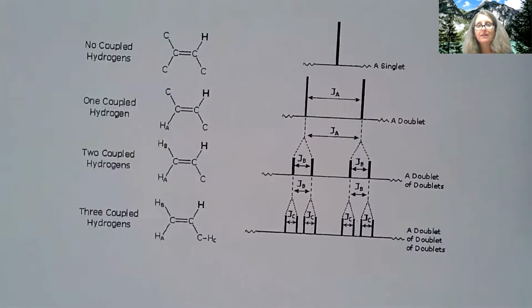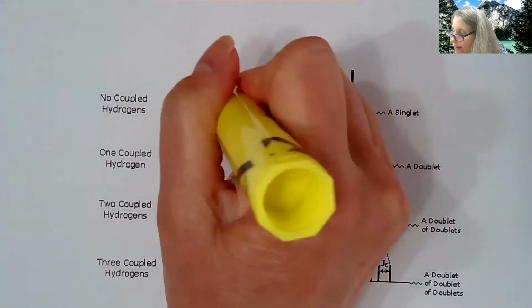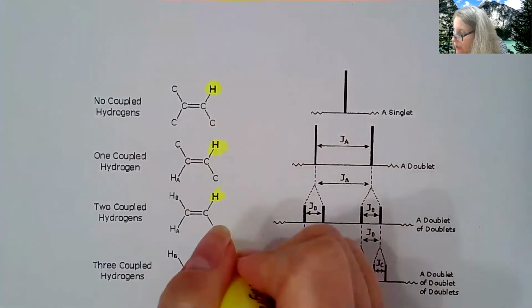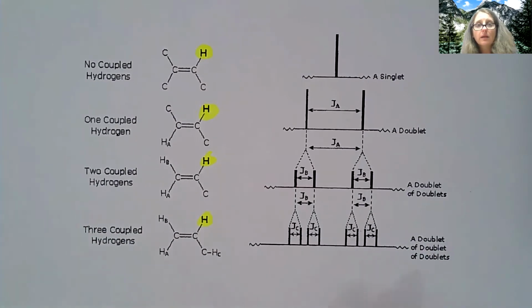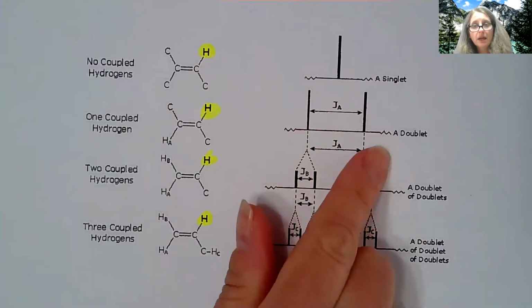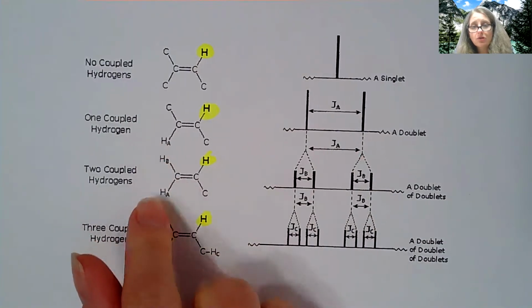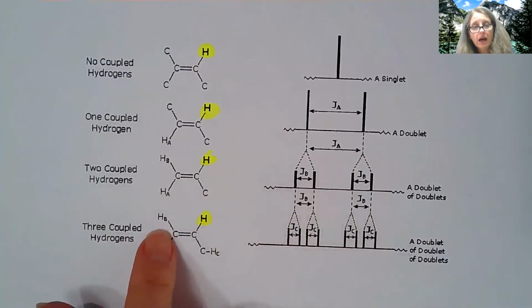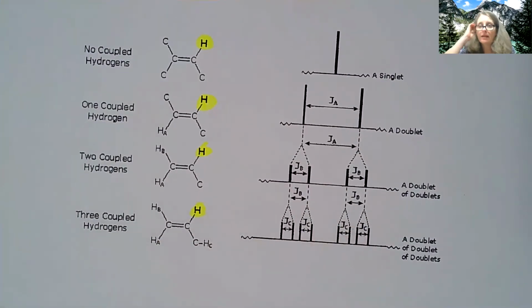And then the last picture here, so kind of the same idea. Again, you are the one that's more bolded, and I know maybe in your notes it may not come out that well, but you are this hydrogen, so you are the one generating this signal. But because it splits to a doublet, it's because of the neighbor is this one. I have 2 hydrogens on this neighbor, so I have this, and then I have neighbor, neighbor, so then it keeps splitting off of that, okay?